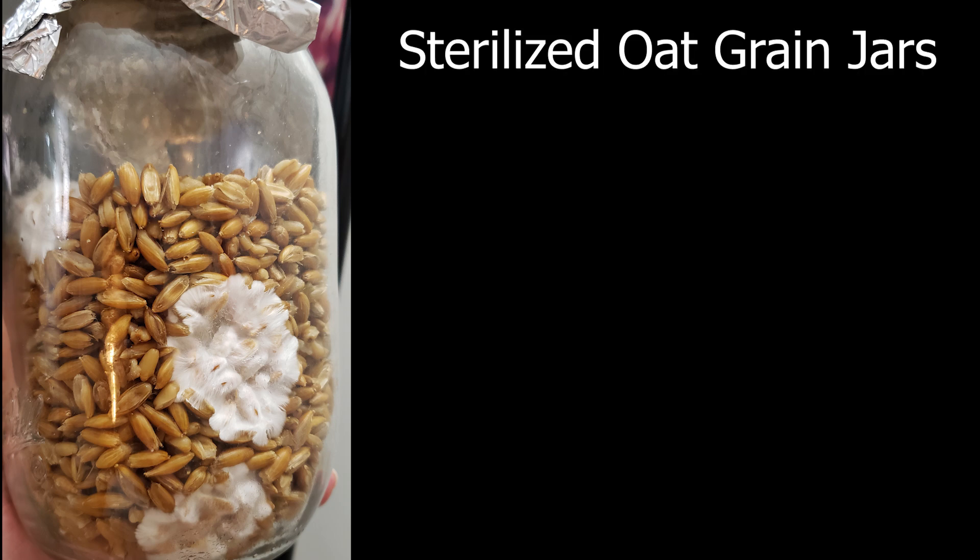What's up students, welcome back to class, it's your sensei PGT. Today I'm going to show you how easy it is to make your own sterilized oat grain jars so that you can grow mushrooms.